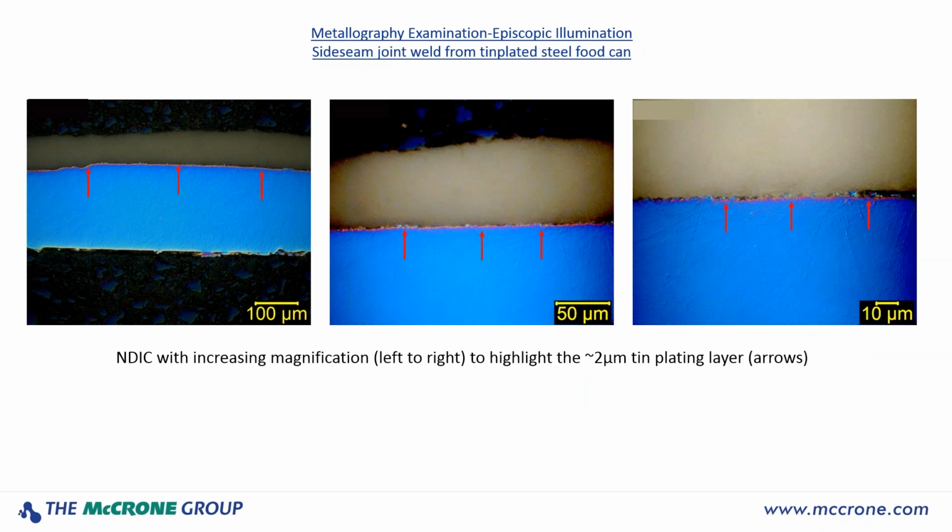Now if we take that same area and increase magnification from left to right here, we can highlight that tin plating layer a little bit more, and we can see that it's approximately 2 micrometers thick. So that's pretty thin for looking at it by light microscopy. It's actually better to look at it by scanning electron microscopy, but we can certainly see it in this imaging technique with NDIC. Note also that in the blue colorization layer, we're not seeing the scratches from the polishing so much, and that's because of the way it's colorizing it.